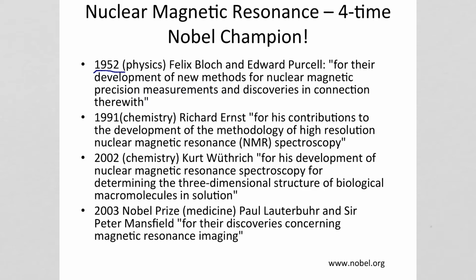I have joked a little bit about how physics is not our friend in terms of gravity and dropping highly breakable objects, but here is an example where physics is the friend to chemistry because they're the ones that discovered this technique, and it is incredibly important. Fast forward to 1991, and Richard Ernst won the Nobel Prize, and his Nobel Prize had to do with a lot of the techniques that we now use to help us understand the structure of molecules. So 1991's prize was the kind of stuff that related to the kind of stuff that we're going to be doing in lab, which is looking at small molecules and trying to determine the structure of them.